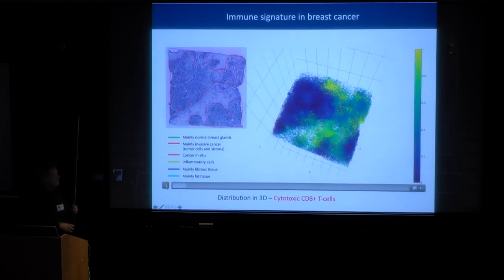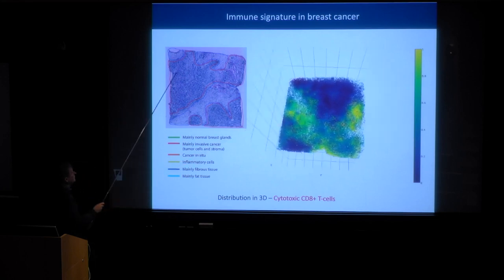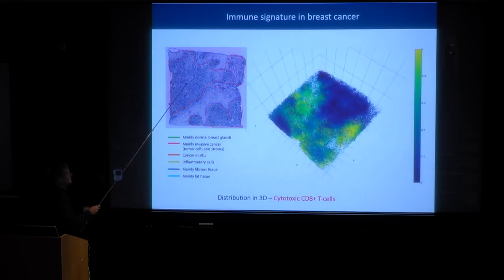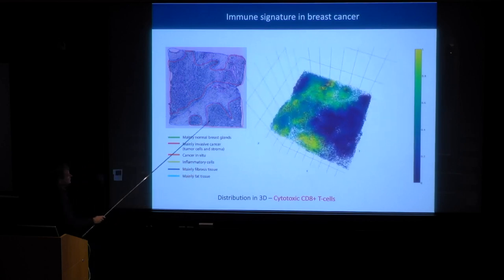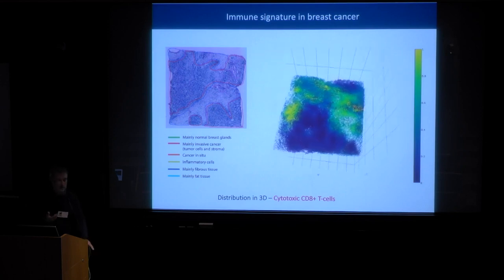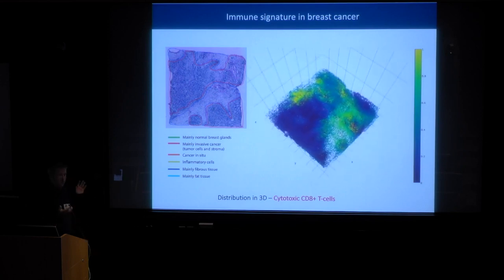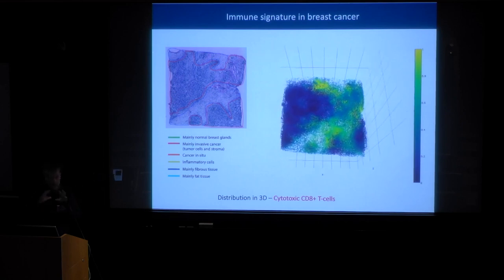So you could actually see, which I think is kind of striking, that this tumor is so-called cold, meaning no infiltration, while this tumor on the other side, coming around the corner here, down here, has infiltration of immune cells, which I think is super interesting because it kind of proves that we have a complex thing with the tumors here in terms of composition of different immune components in terms of the cell.